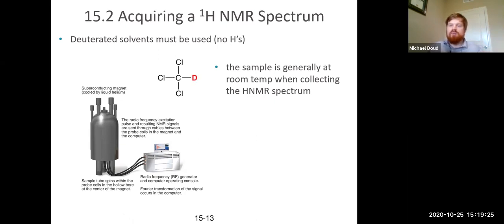So then that's no good, right? You need to find something else. You kind of slowly work your way up. Heavy water, D2O, is relatively cheap as well. You can get that relatively inexpensively.